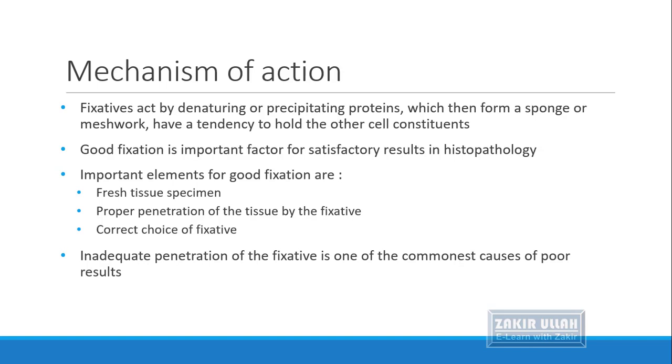One of the commonest causes of poor results is inadequate penetration of the fixative. The tissue does not come in contact with the fixative, so the tissue does not get fixed and we do not get the proper results that we want to achieve. So for good results, we need to have proper penetration of the fixative into the tissue.